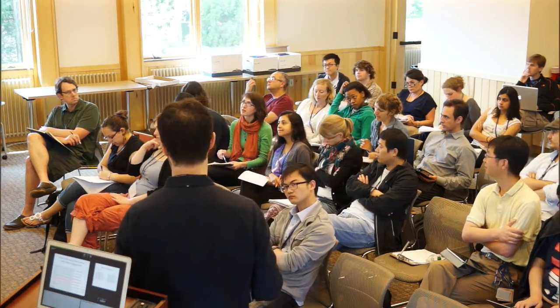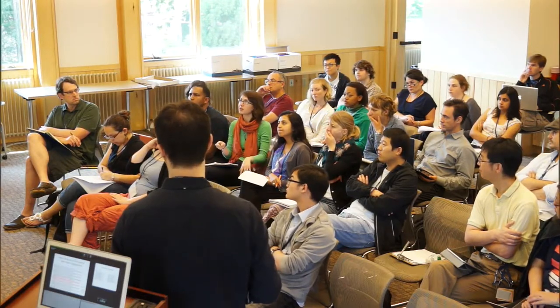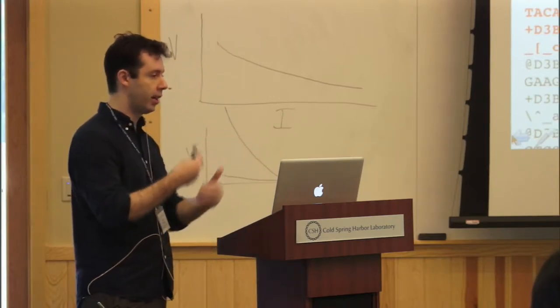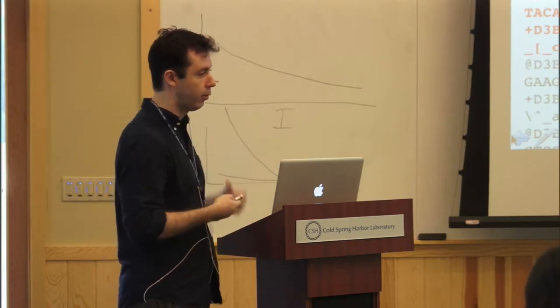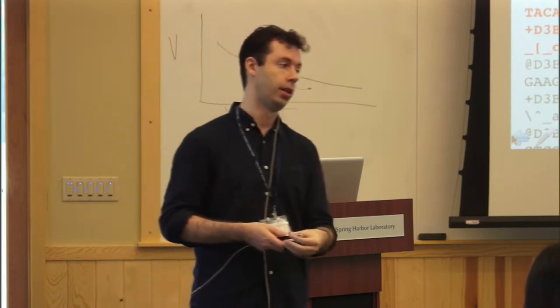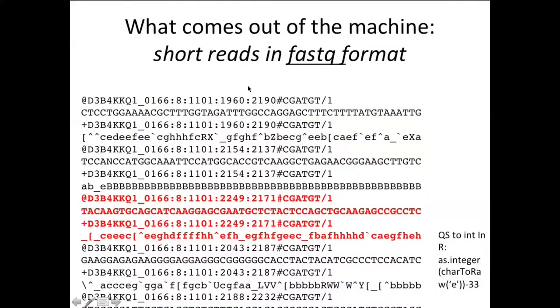So, when I look at the FASTQ format, I can see the index. Did the machine already remove the barcode? Yeah, so now Cassava, which is the tool that you use to process the reads and get to this FASTQ format, is taking care of the demultiplexing, the indexing for you. You don't have these indices here in the sequence. They've already been taken out.